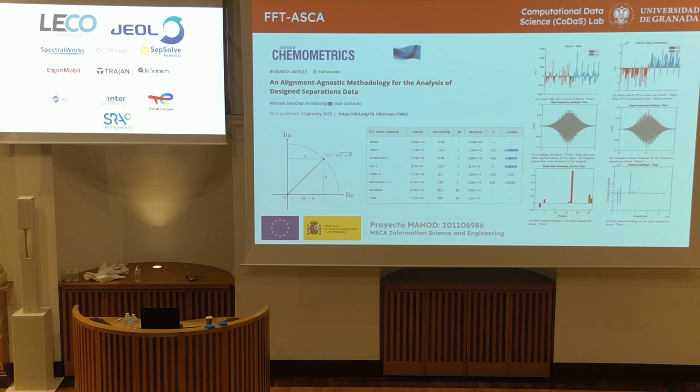But if you do the inverse transform, after calculating statistical significance for the factors you're interested in, say time, you can see it in this sort of ANOVA-like table right there, you can do the inverse transform on the factorized matrices, and you can see in the raw data the peaks that are responsible for differentiating in the frequency domain. Now, I compared this with the peak table analysis, and the peak table analysis had a lot of zeros, but when you accounted for the zeros, this experimental data was consistent with the peak table analysis. So again, if you let go of the peak table, wonderful things can happen, but you have to be willing to let go of the peak table. If you're not willing, it's not going to happen.